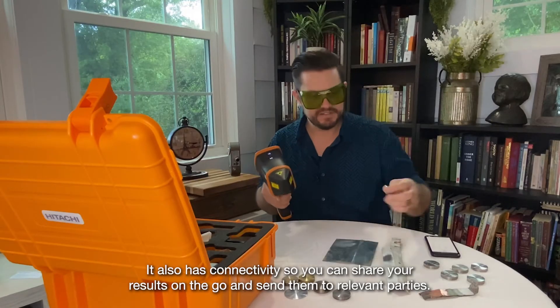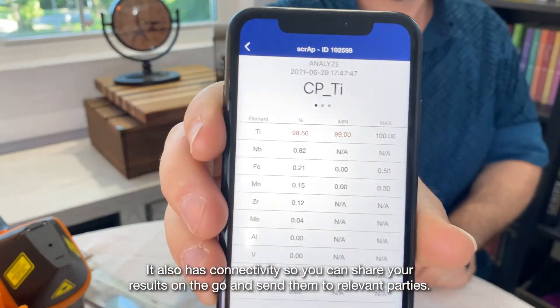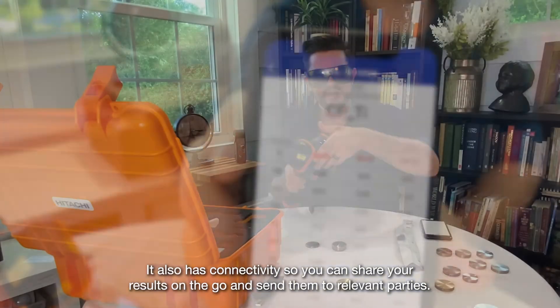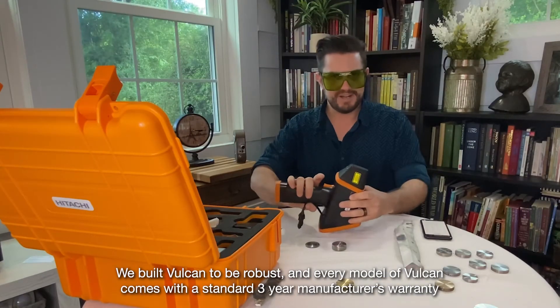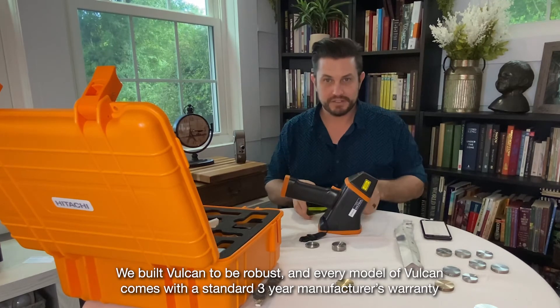It also has connectivity, so you can share your results on the go and send them to relevant parties. We built Vulcan to be robust, and every model of Vulcan comes with a standard three-year manufacturer's warranty.